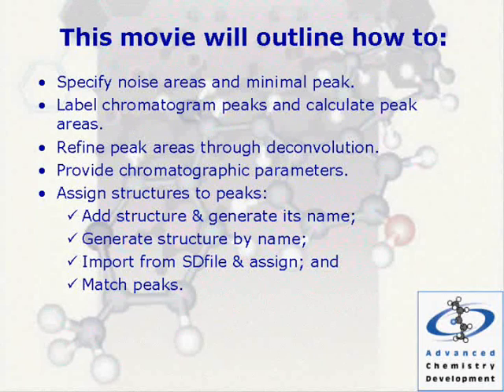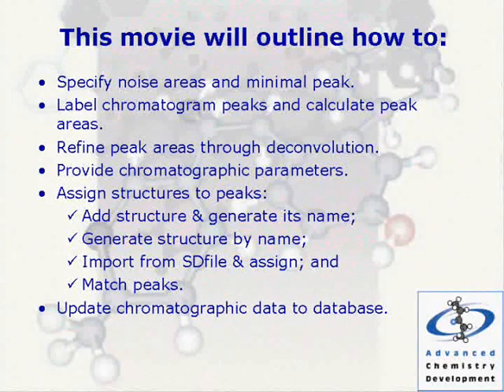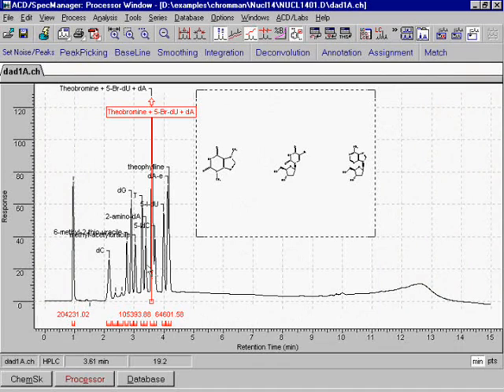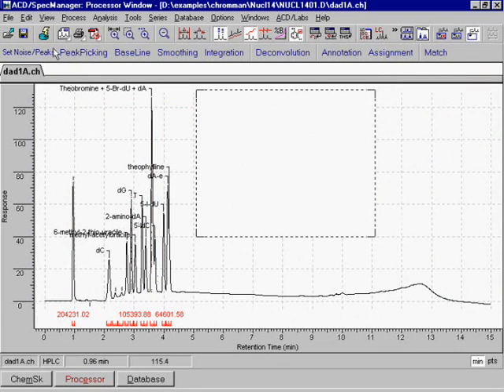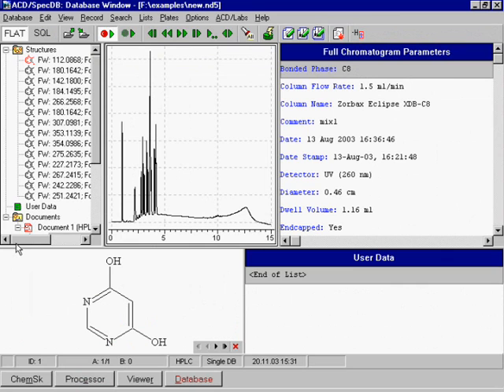Update chromatographic data to a database. After the chromatogram has been processed, ACD Labs customers who own the ACD Chrome Manager module can save their file to a database.